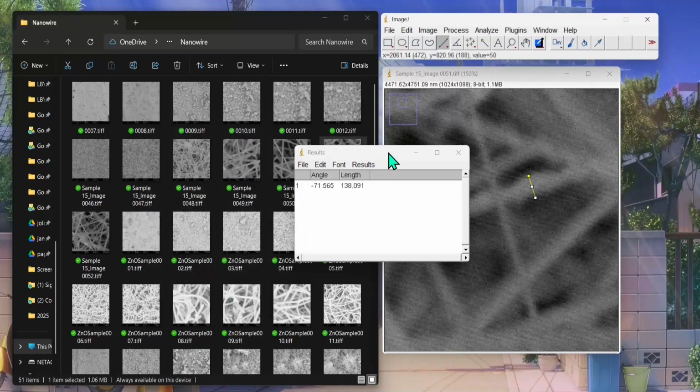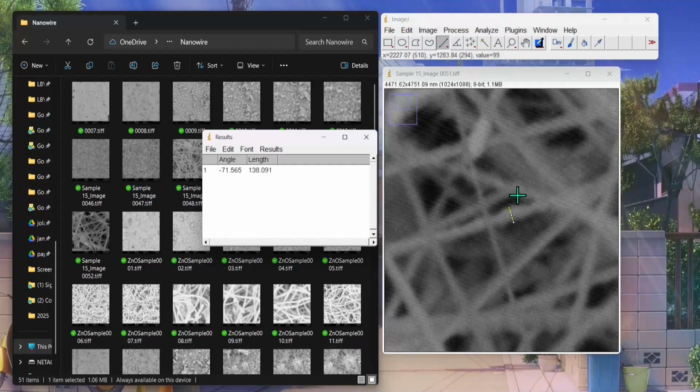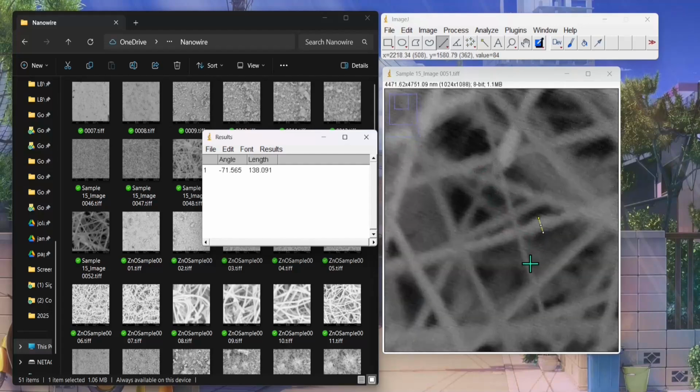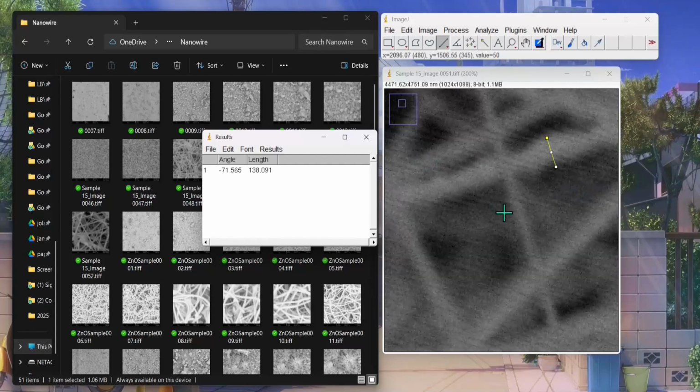So therefore, according to the standard dimension for nanowires, this one is not yet a nanowire, because the maximum diameter of a nanowire should be 100 nanometers. So we should be looking for that kind of wire. I think this one is smaller, of course, as you can see here, but let us just check if this is under nanowire.